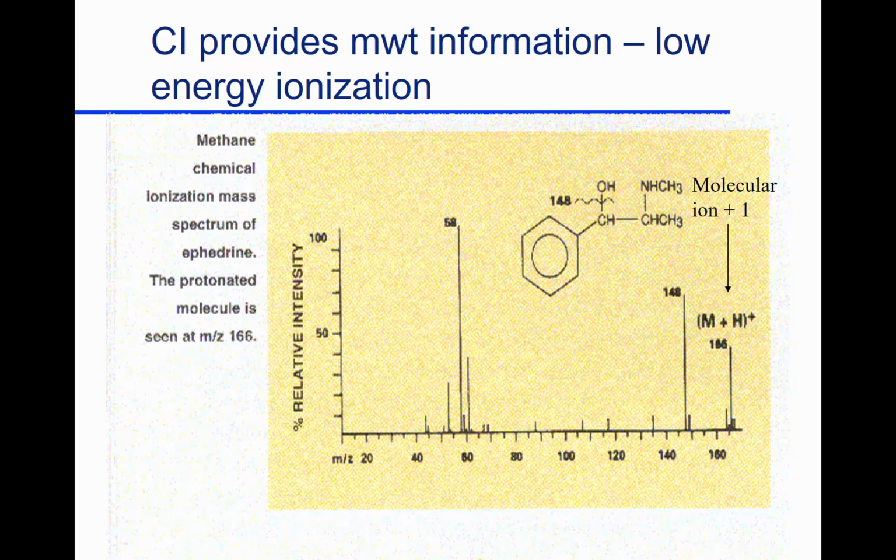Now it's interesting, in chemical ionization, we ionize our analytes by transferring a hydrogen onto them. So I'm adding a proton onto each of my molecules as they come through the mass spectrometer. So this has a mass of 165, but what does my mass spectrometer measure? 166. So it's picked up one proton, and you'll always see it's +1, +1. We always add one more onto it. So we see more fragments, and we can get an identification of molecular weight, which is what we want.